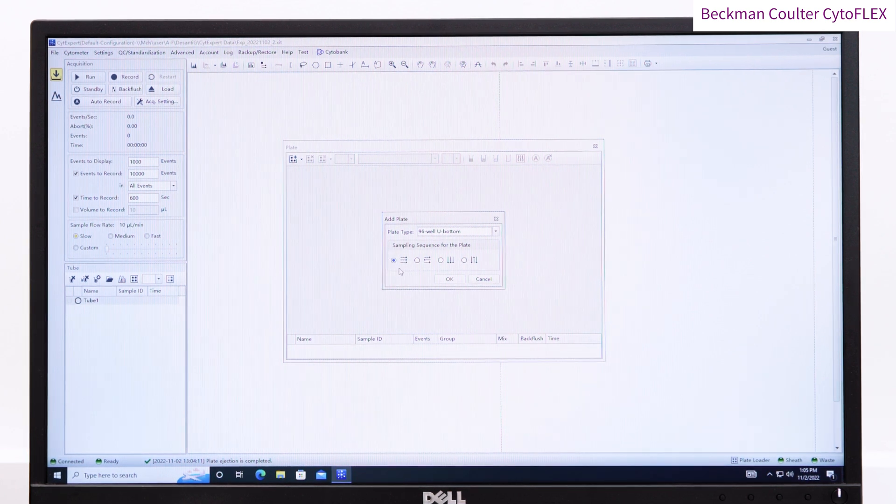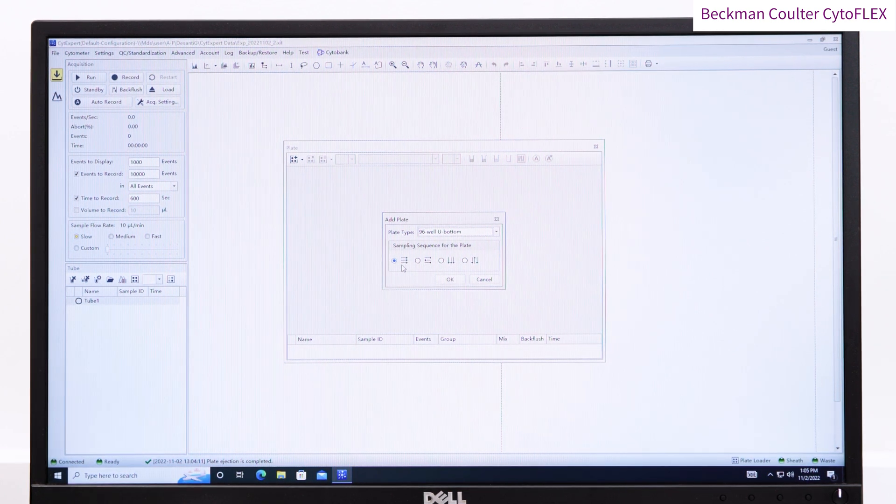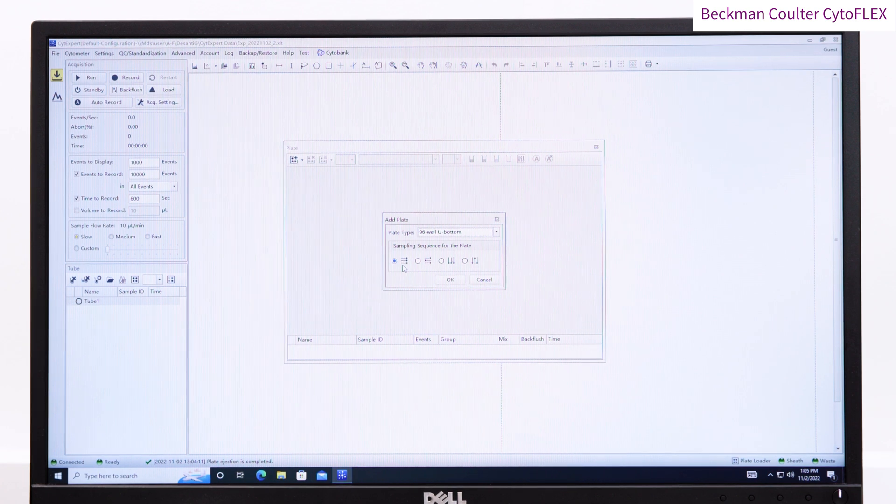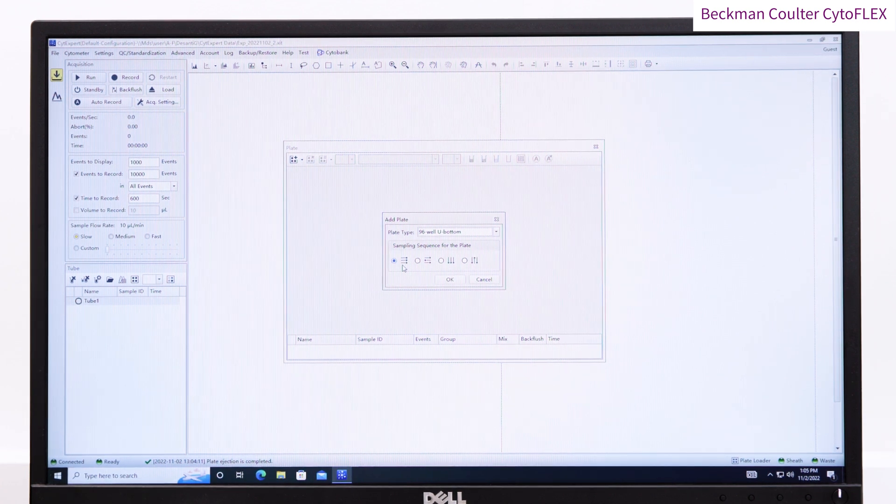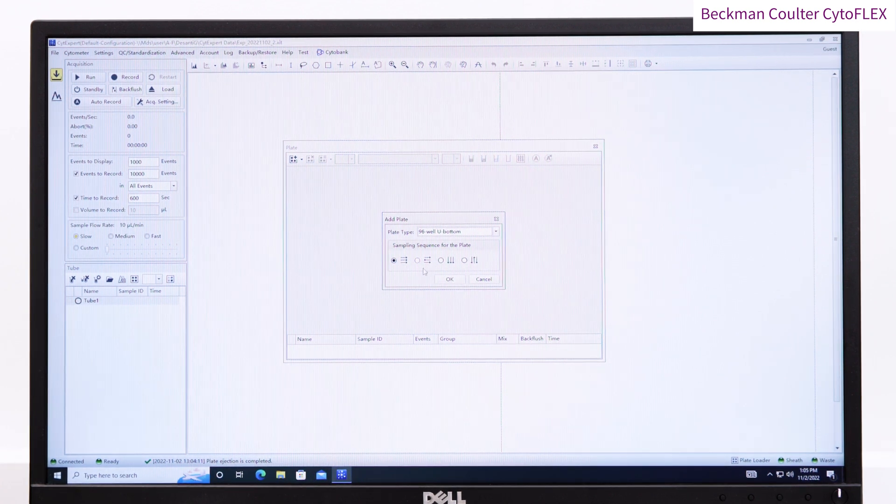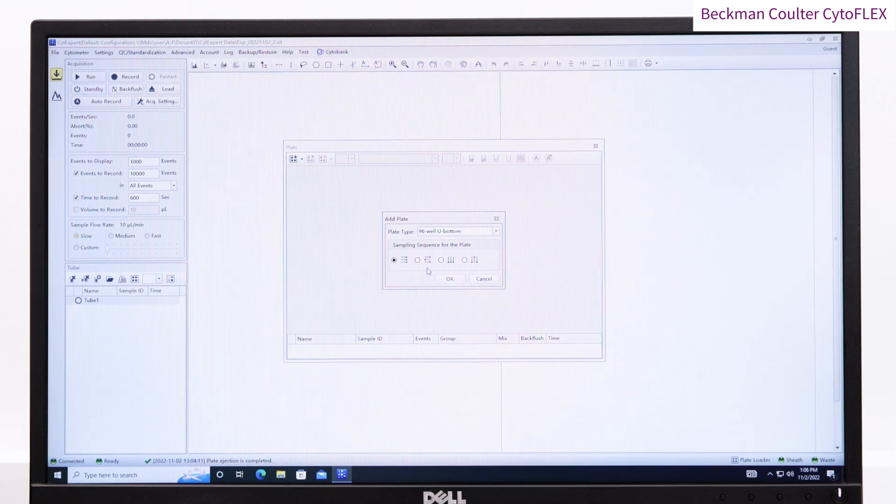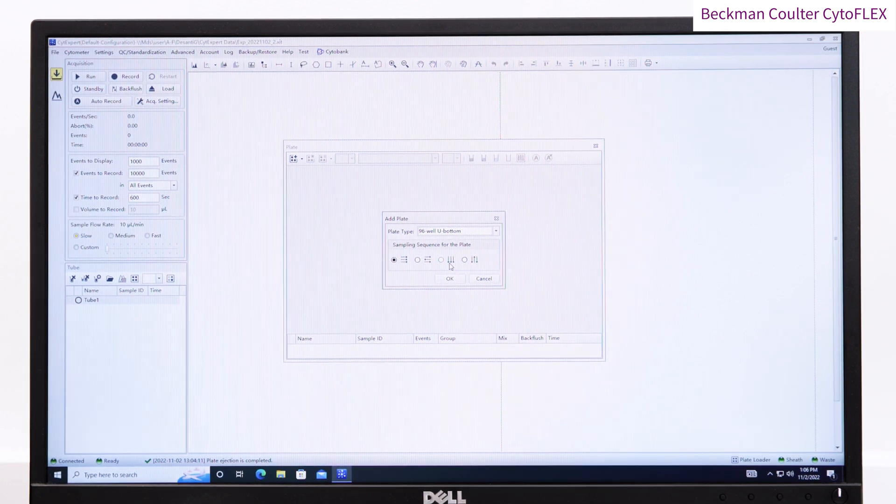Saved acquisition settings can be loaded at this point. You can adjust the mix and backflush settings. Larger cells tend to require a longer mix time, and the longer the backflush time, the lower well-to-well carryover there will be.